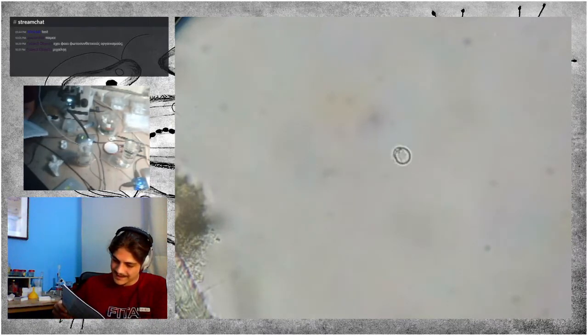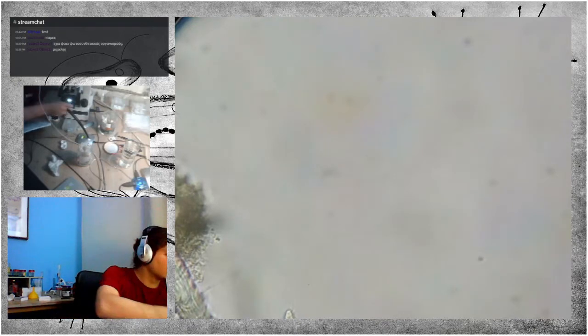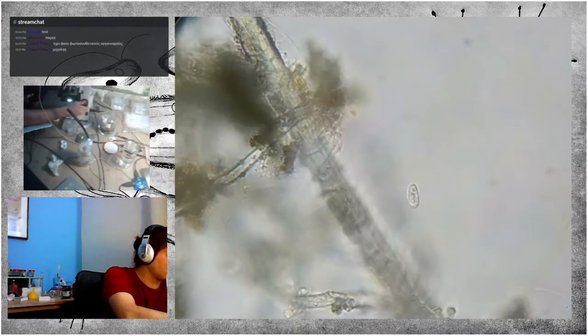Now, I think this could be part of the genus Euronema. Or not.